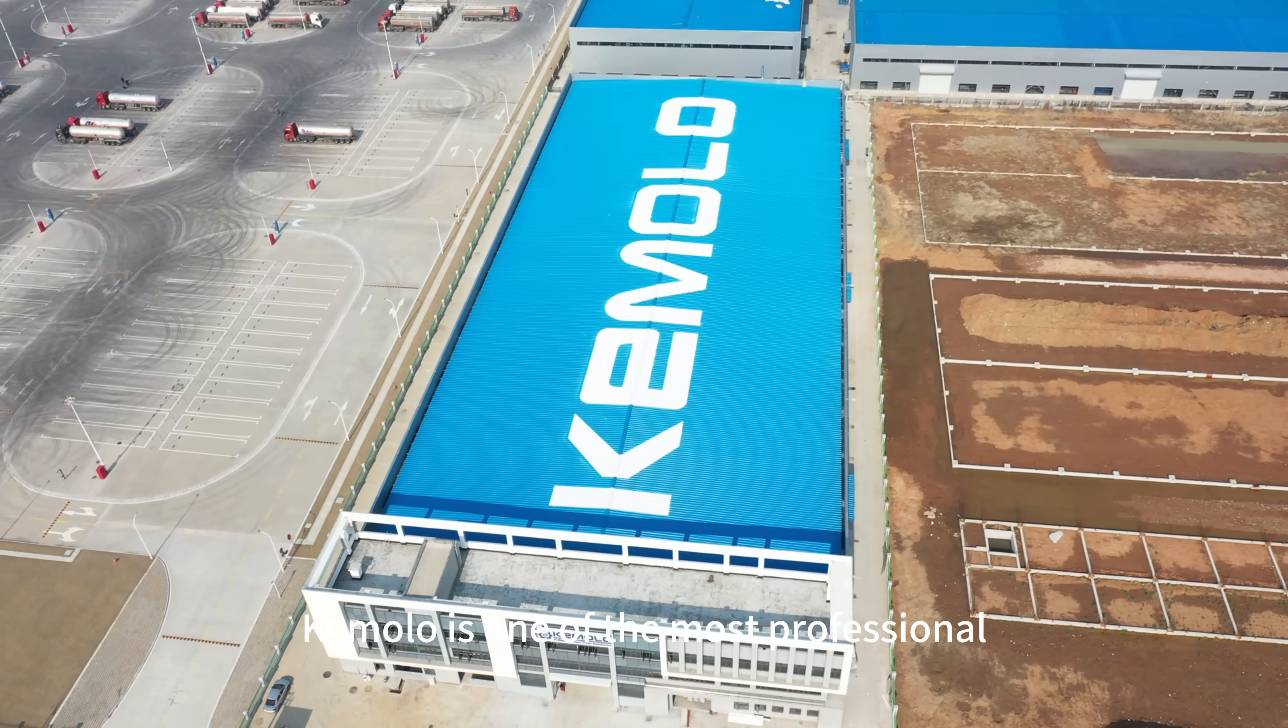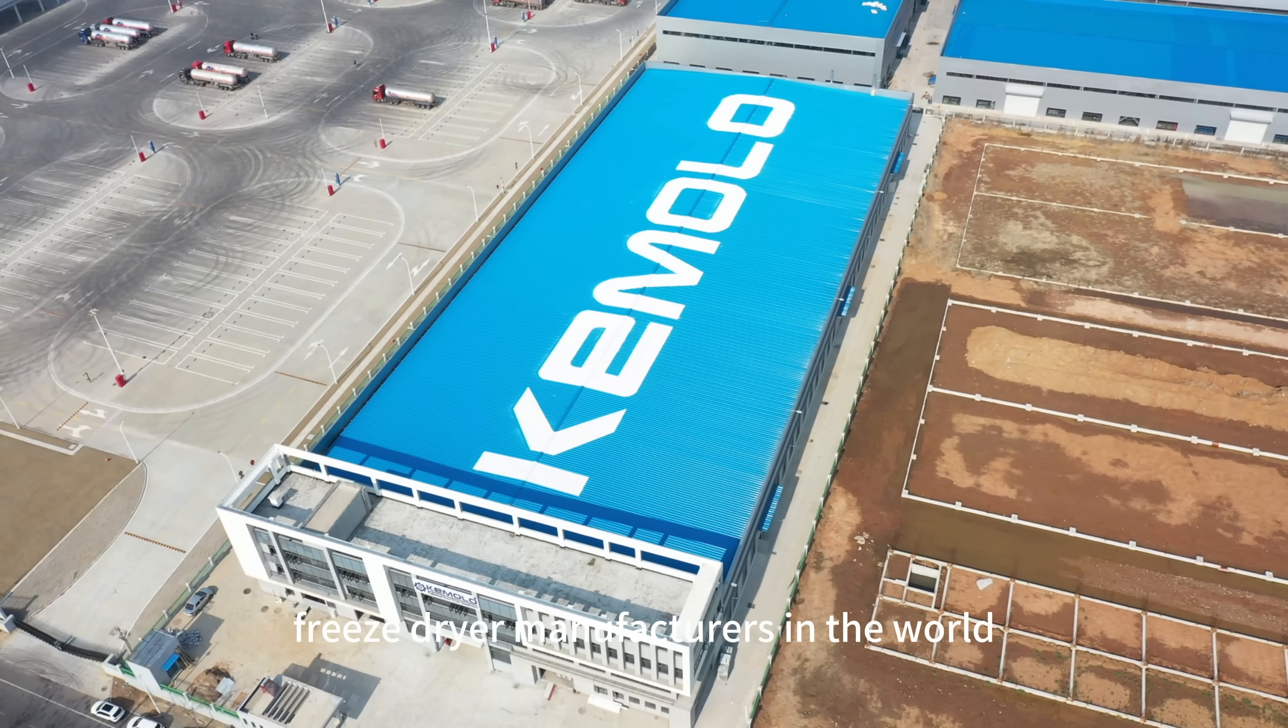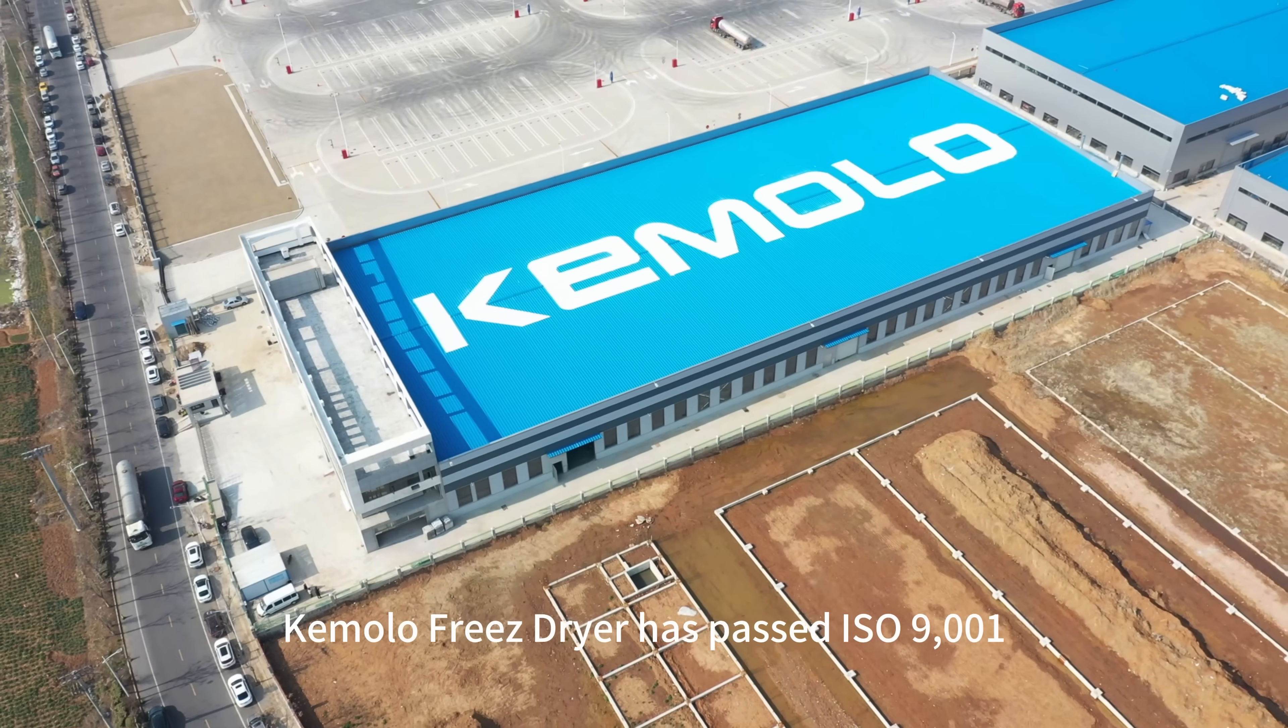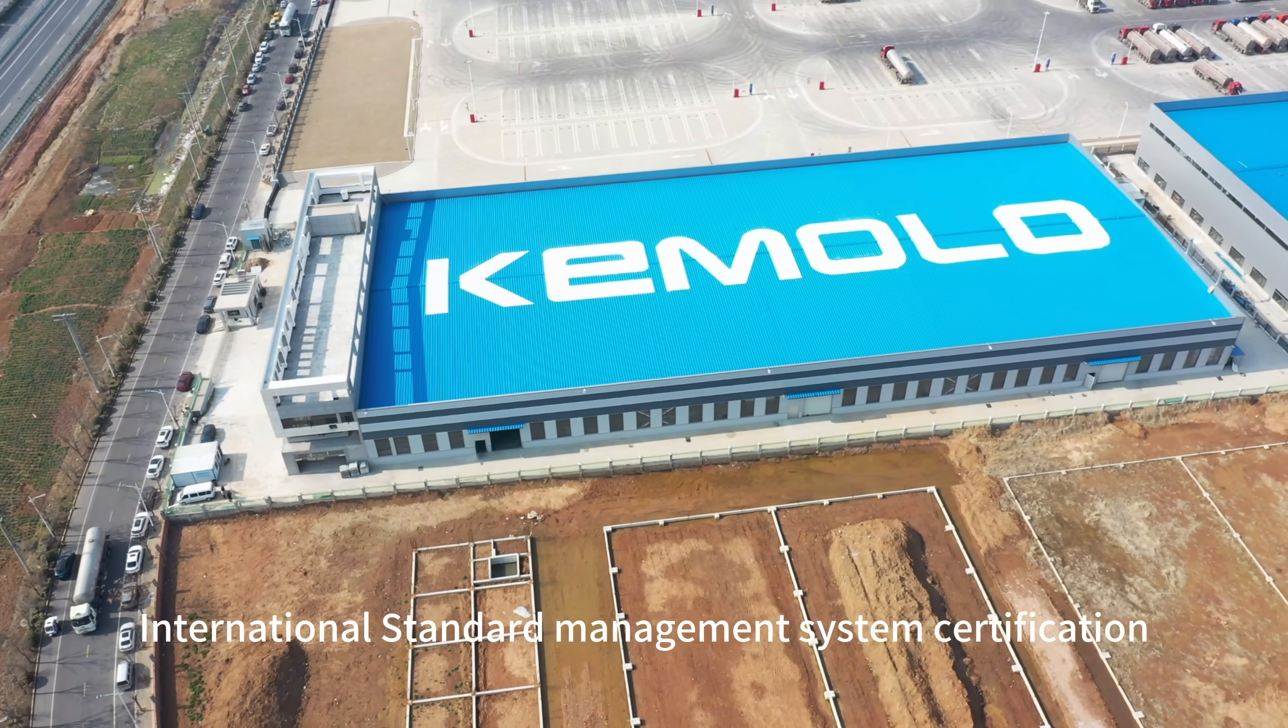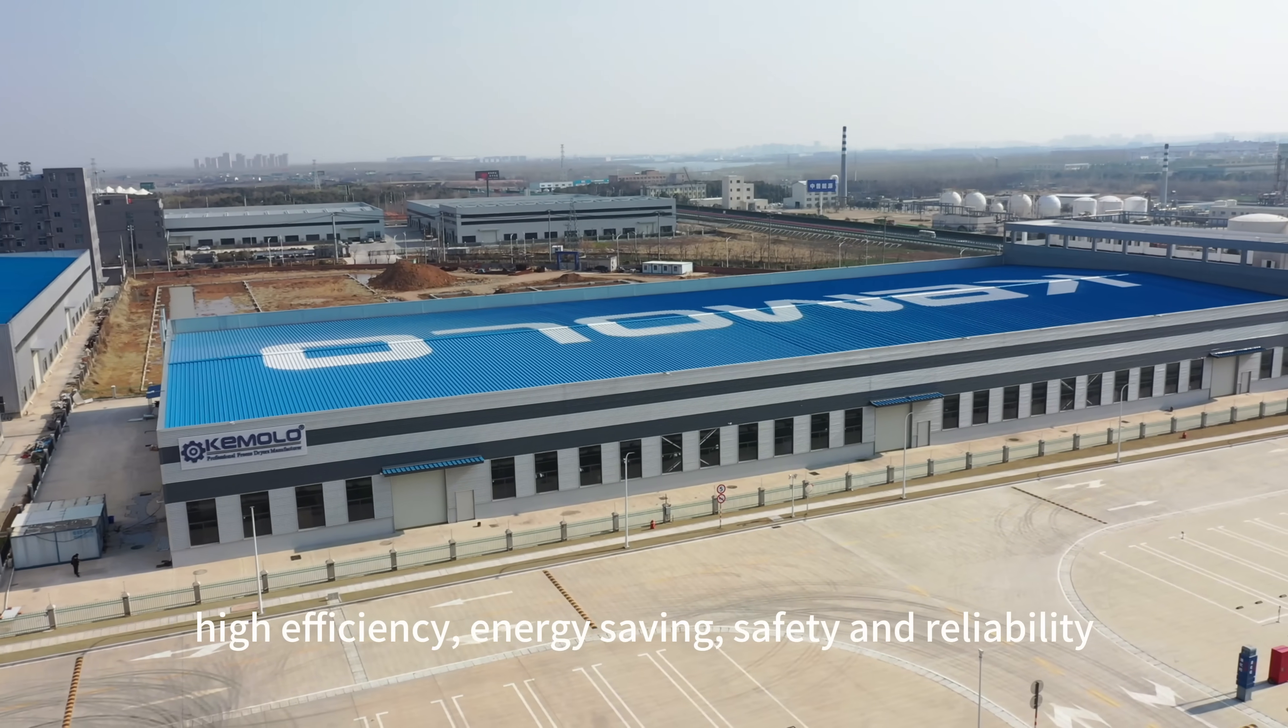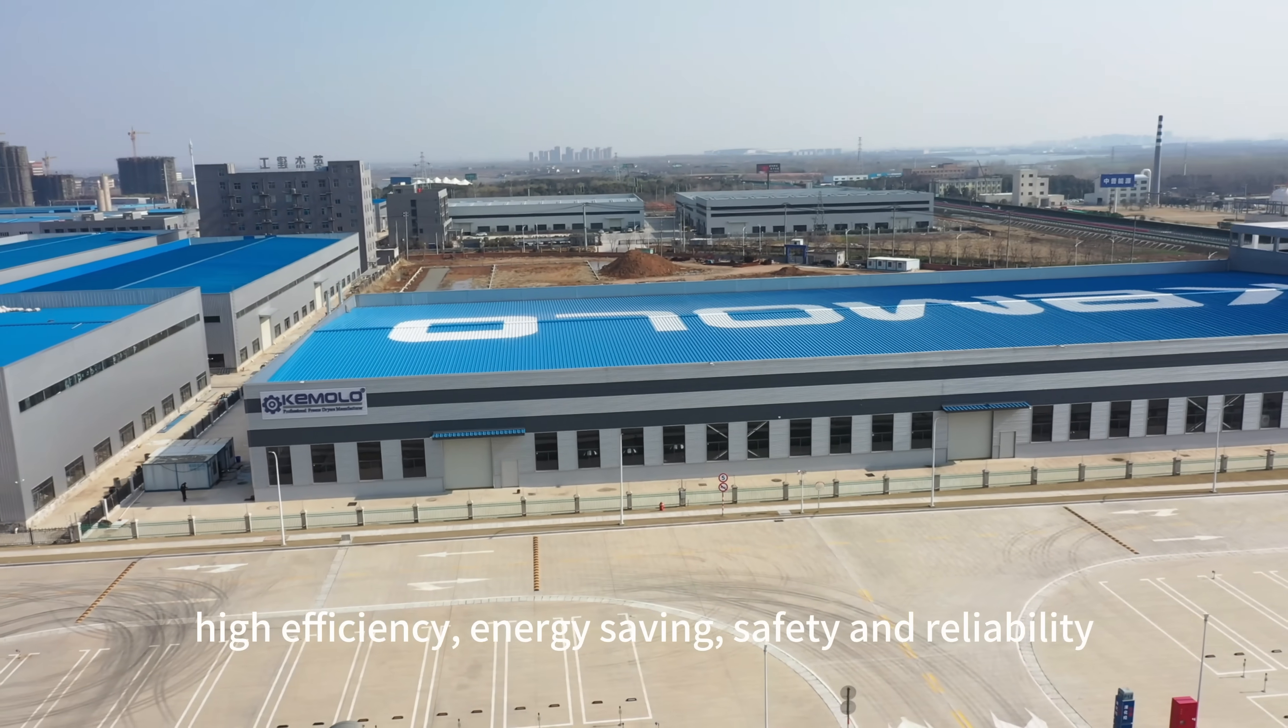KEMOLO is one of the most professional freeze-dryer manufacturers in the world. KEMOLO freeze-dryer has passed ISO 9001 International Standard Management System Certification with large output, high efficiency, energy saving, safety and reliability.